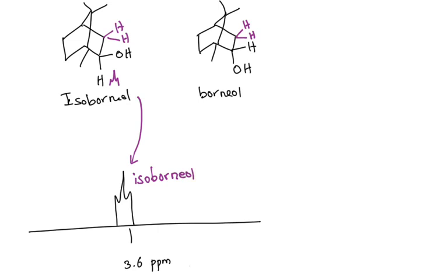For borneol, you probably see something like this, close to 4.0 ppm.